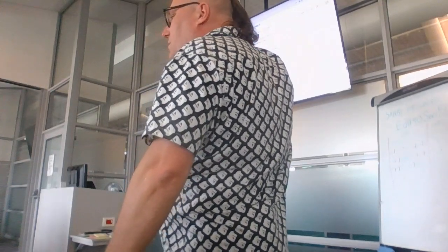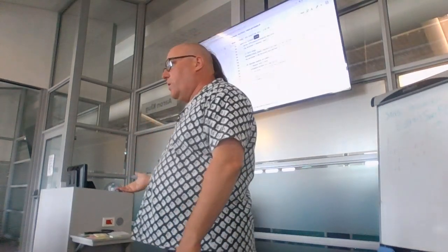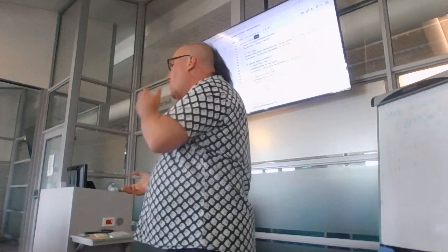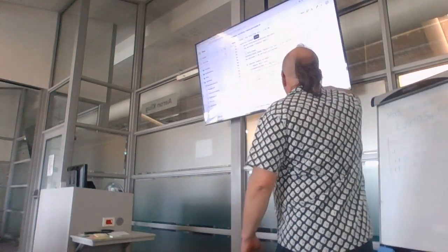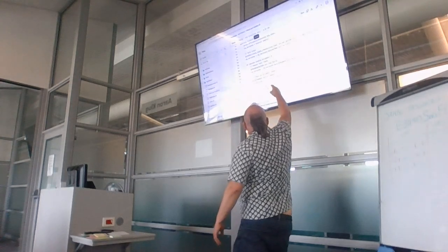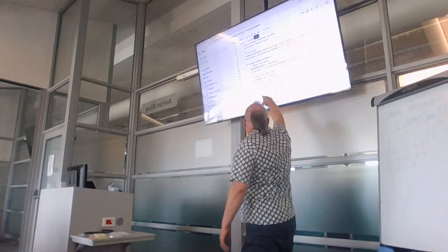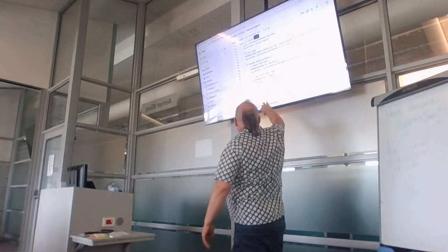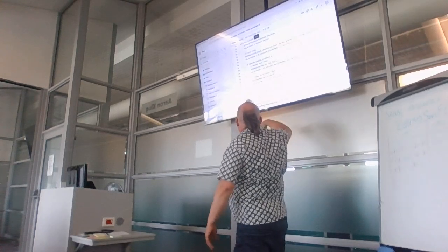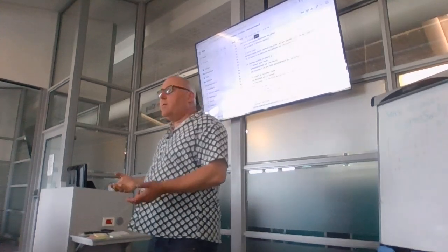line 57, if parameters says enable scrubber, then the comment on line 58 says remove the host reads, or the human reads, okay? And then run QC. And if you don't enable scrubber, then run QC anyway. And then it basically gets the versions, and then eventually it runs a thing called dump software versions, okay?